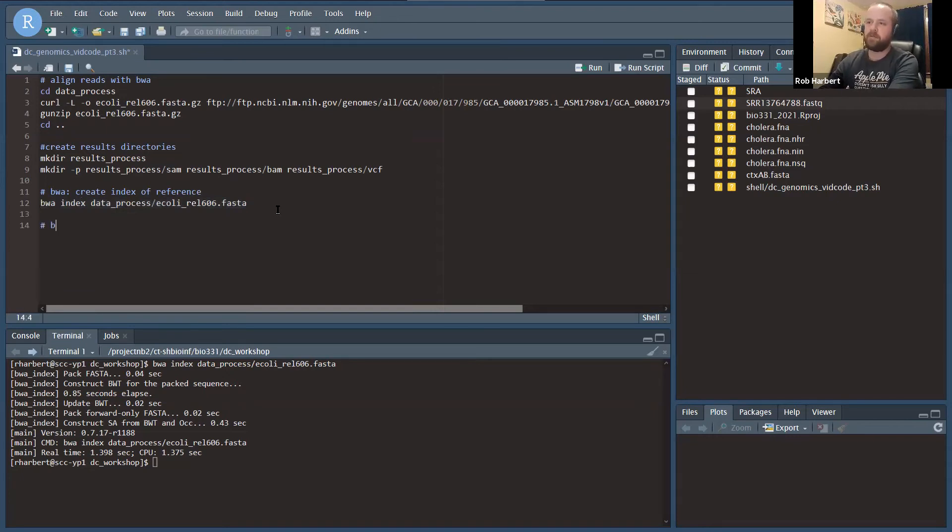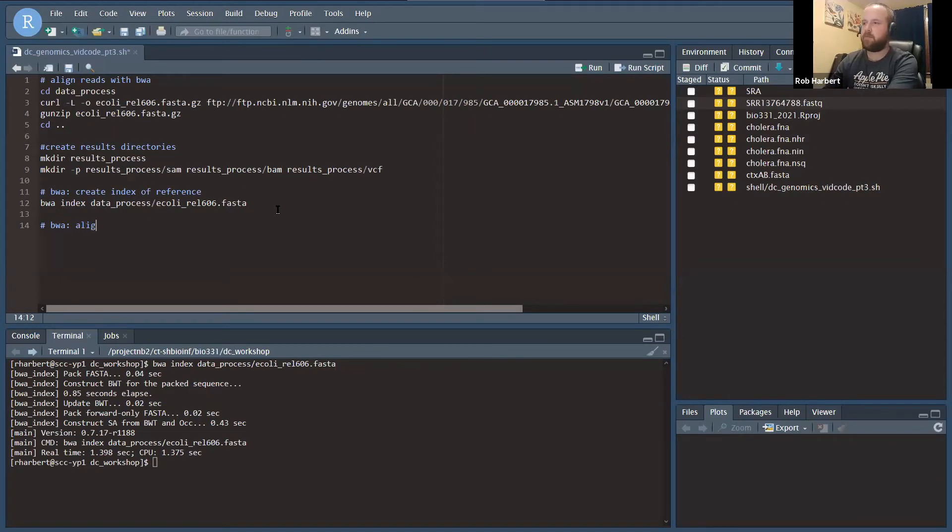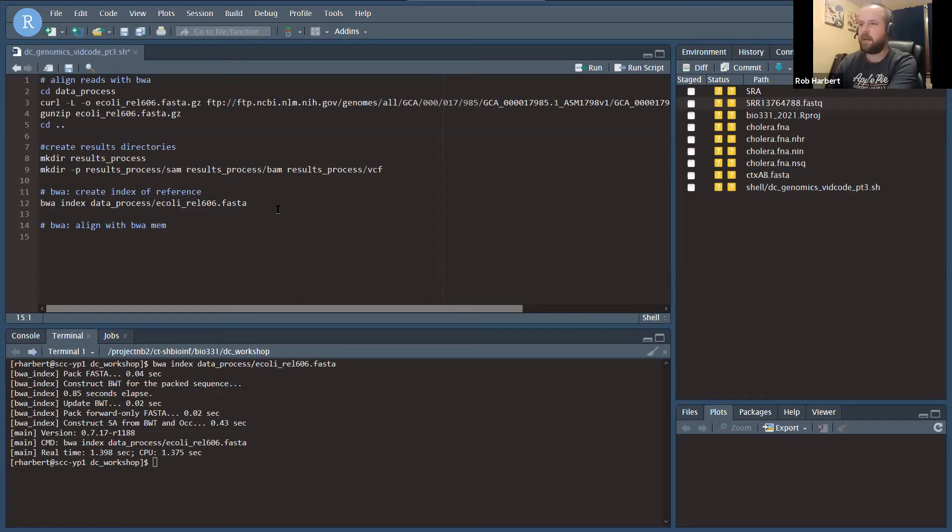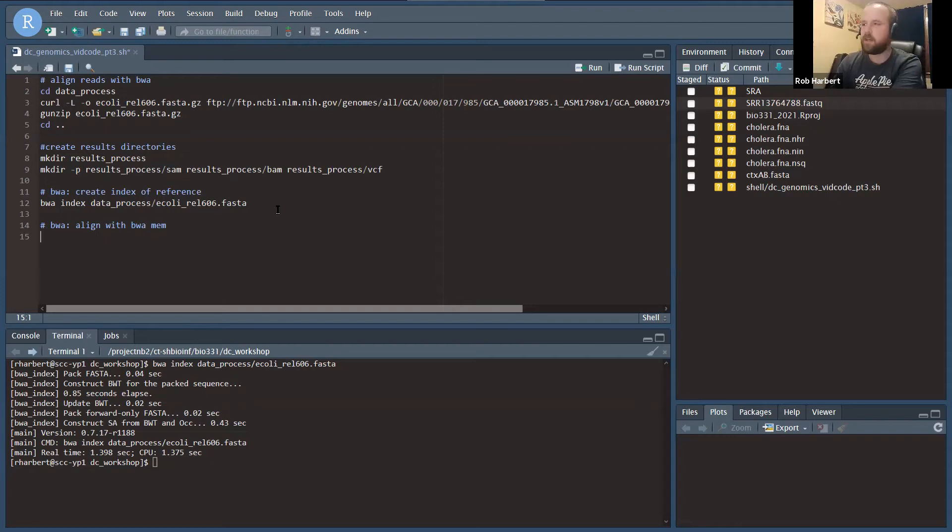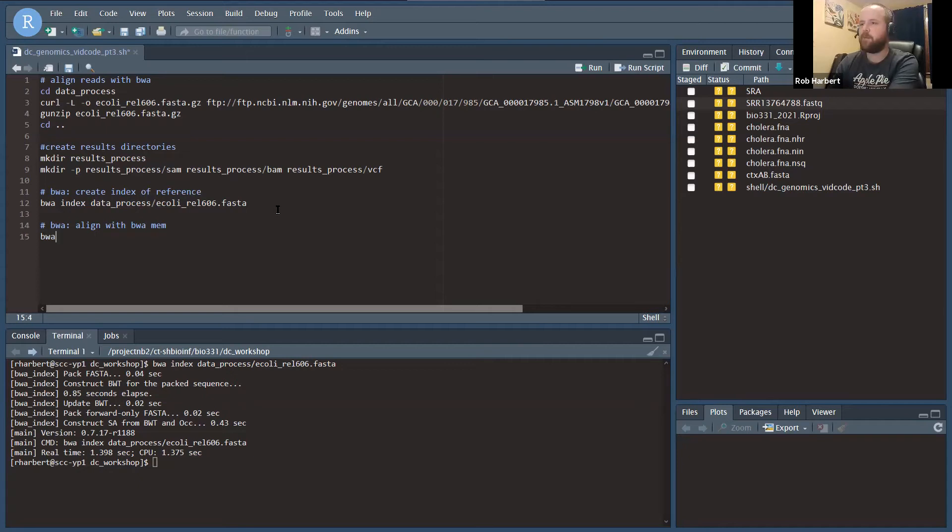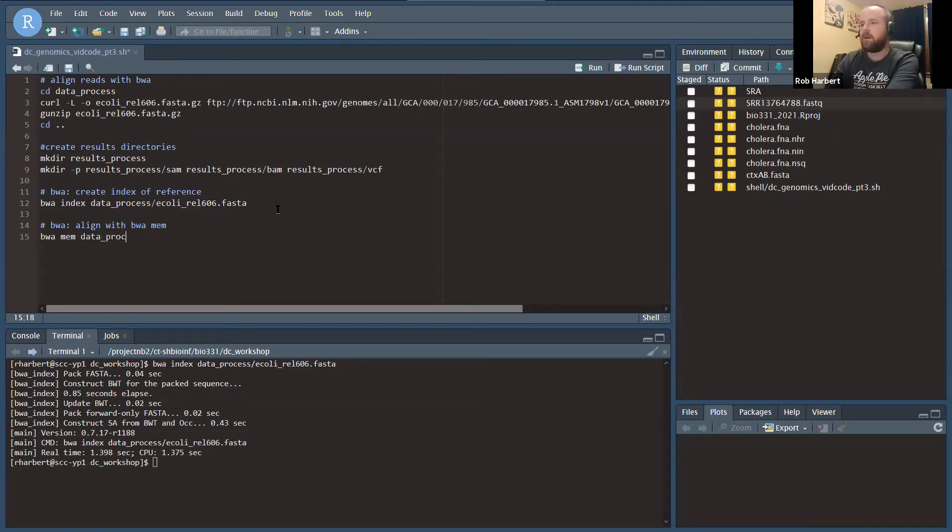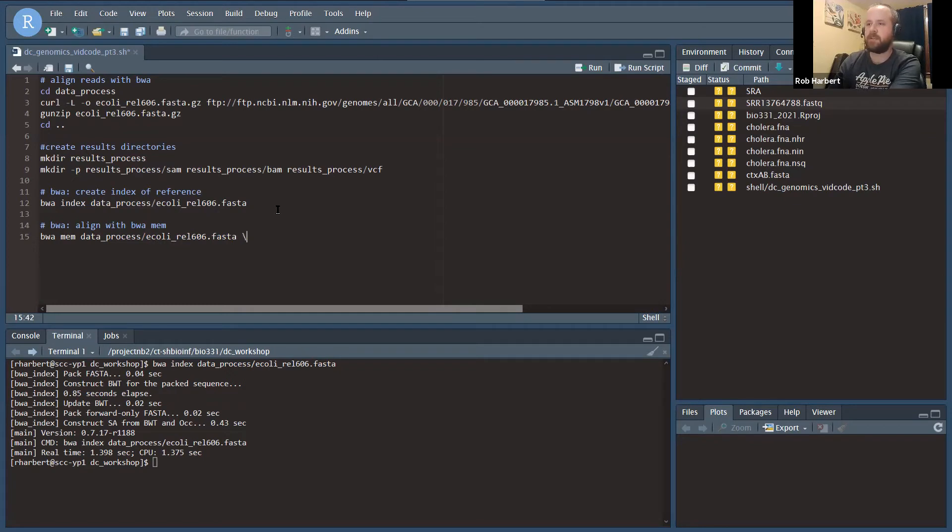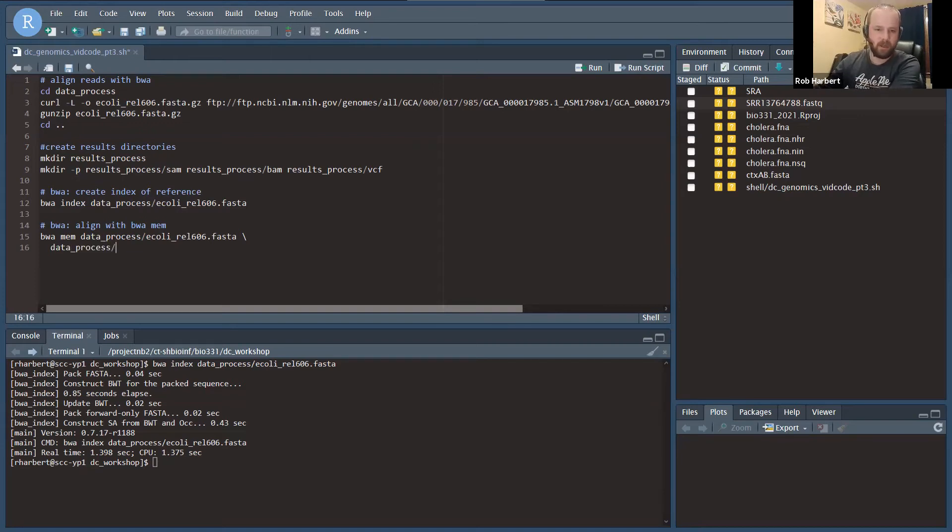Next up we're going to use BWA to align with BWA MEM. The point of this video is not to discuss the different alignment algorithms. BWA MEM is suitable for most typical alignments. If you're using paired-end Illumina data, most likely BWA MEM is what you want. That starts off BWA MEM, and then we're going to do the path to our reference, and then I'm going to put a backslash so I can go into the next line.